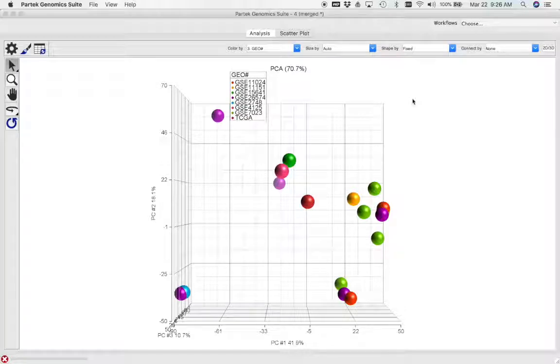Without digging into the mathematics and talking about eigenvectors and matrix theory, what you should understand about a PCA plot is it uses all the variables, or at least the variables that change within a group of samples. In this case, this is our biosets, and plots them based on these variables in three-dimensional space, so that samples or biosets that are more like each other will be closer together, while biosets or samples that are more dissimilar will be farther apart. And this just gives us a good way to get an overview of the data. We can actually spin this data any way we want.